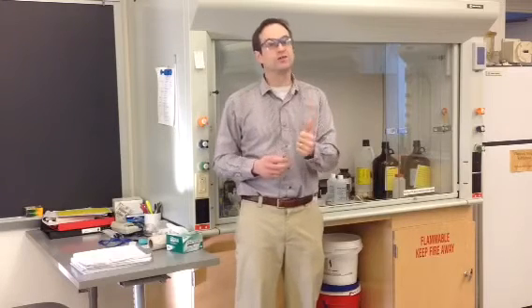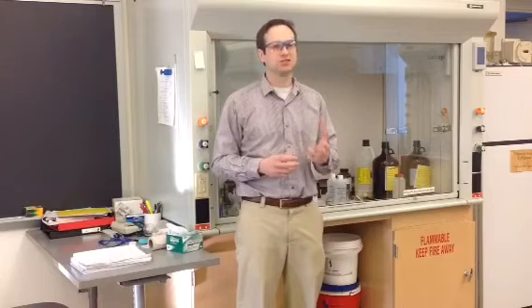So hopefully that covers everything we need to know about the practical aspects of this lab. It's pretty straightforward. But again, to recap, what's the important issue? The carboxylic acids that we're going to be working with are very, very smelly, and they'll go with you when you go back to your dorm or back to your house. It certainly is a smelly chemical. So keep everything in the hood. Nothing gets washed in the sinks until those compounds have been completely removed. All right? Okay?